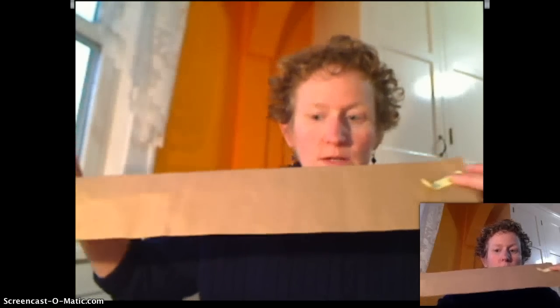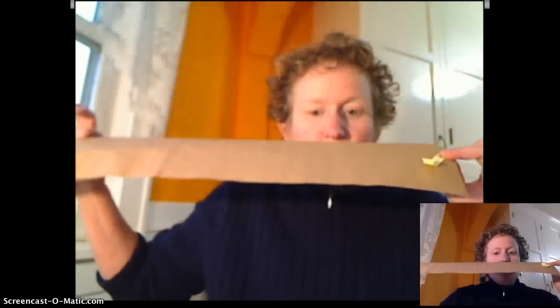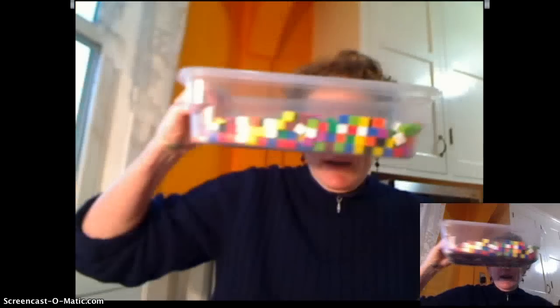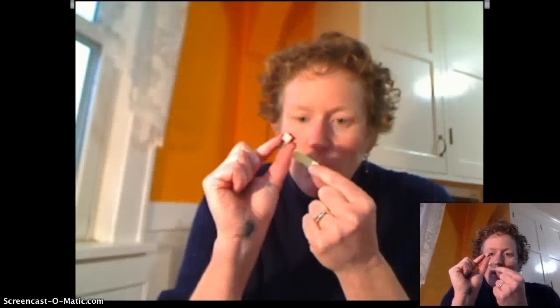The next thing we're going to do is compute the ratio of the surface area to the volume. That's how many of these fit in our little cube. The surface area divided by the volume. For the big cube, it's going to be 600 divided by 1,000. For the little cube, it's going to be 6 divided by 1.